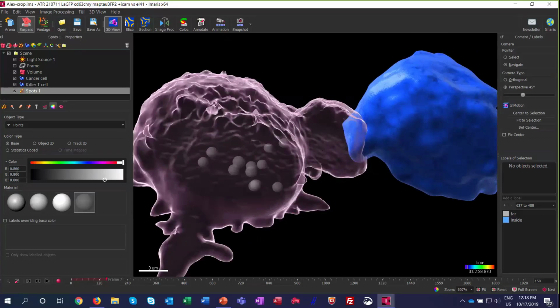Okay. So those are the changes that have gone into this insightful rendering. We are, as I've said before, so excited to let you all get your hands on this and start to work with this.